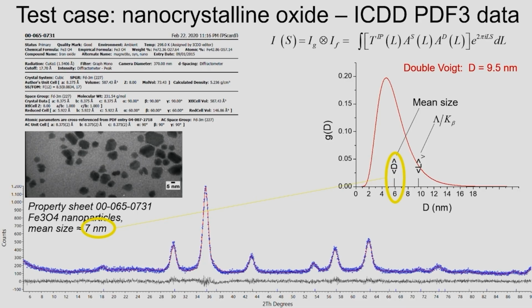Now strain adds some complexity, because about strain we know some general features about how inhomogeneous strain acts on the broadening of the peak. So keep in mind this. If the strain is homogeneous everywhere, you're sort of squeezing or pulling your crystal and you will just shift the Bragg peaks, okay? Now, when it is inhomogeneous, so it changes from point to point and even differs along different directions because of dislocations, grain boundaries, whatever happens in your crystal, then you have some broadening of the peaks.